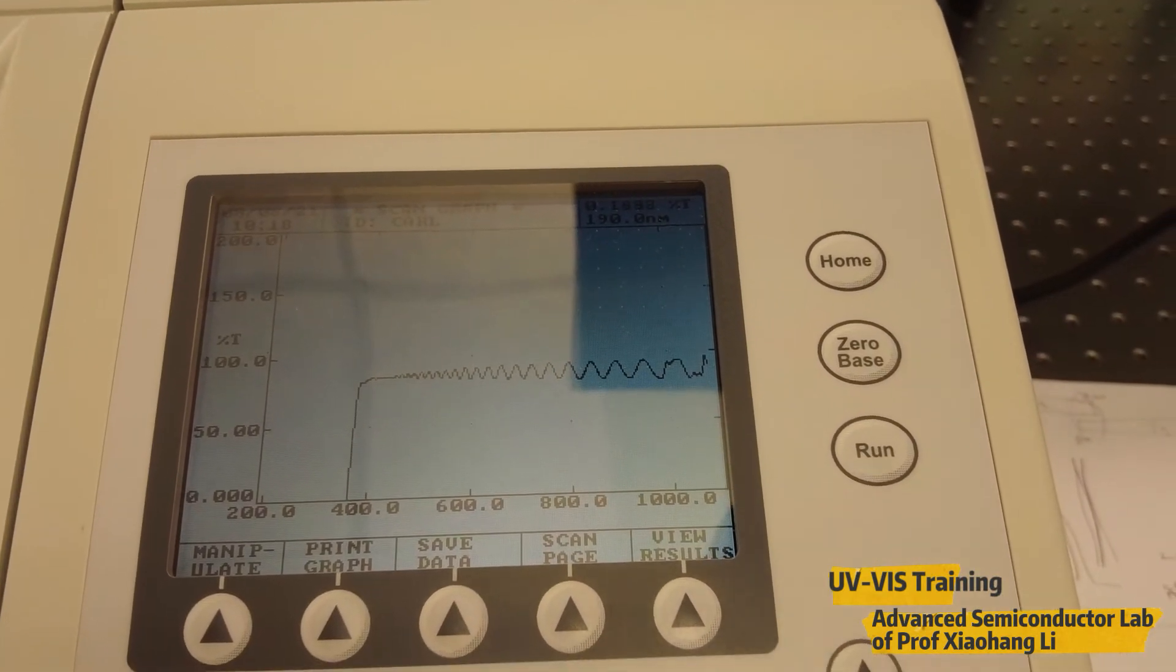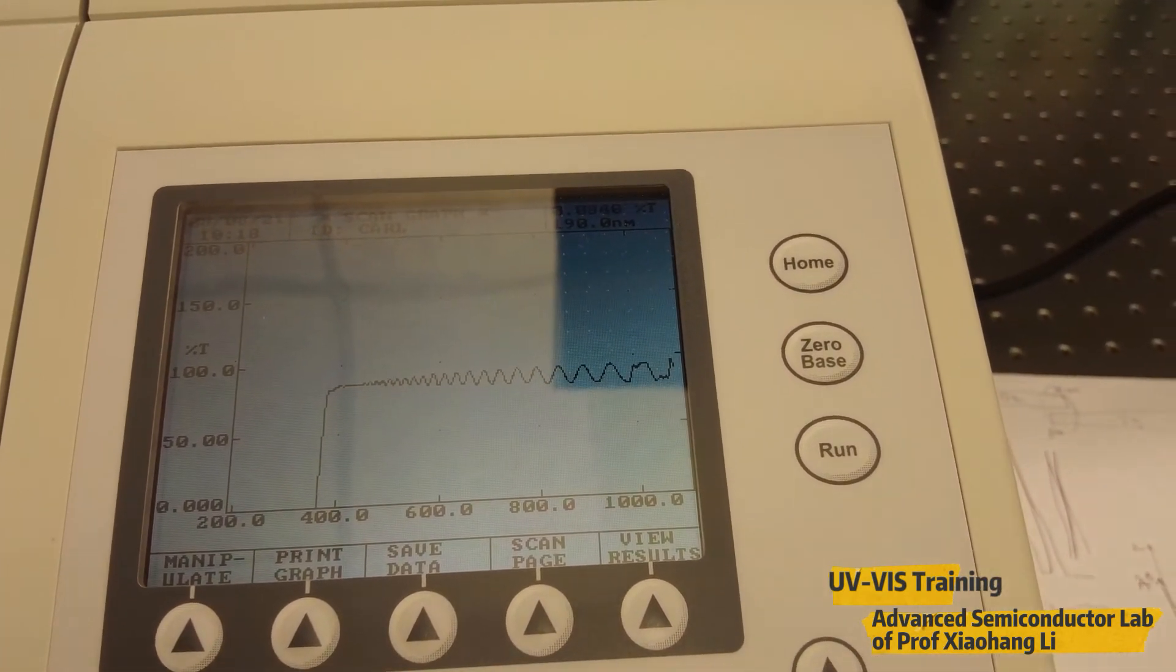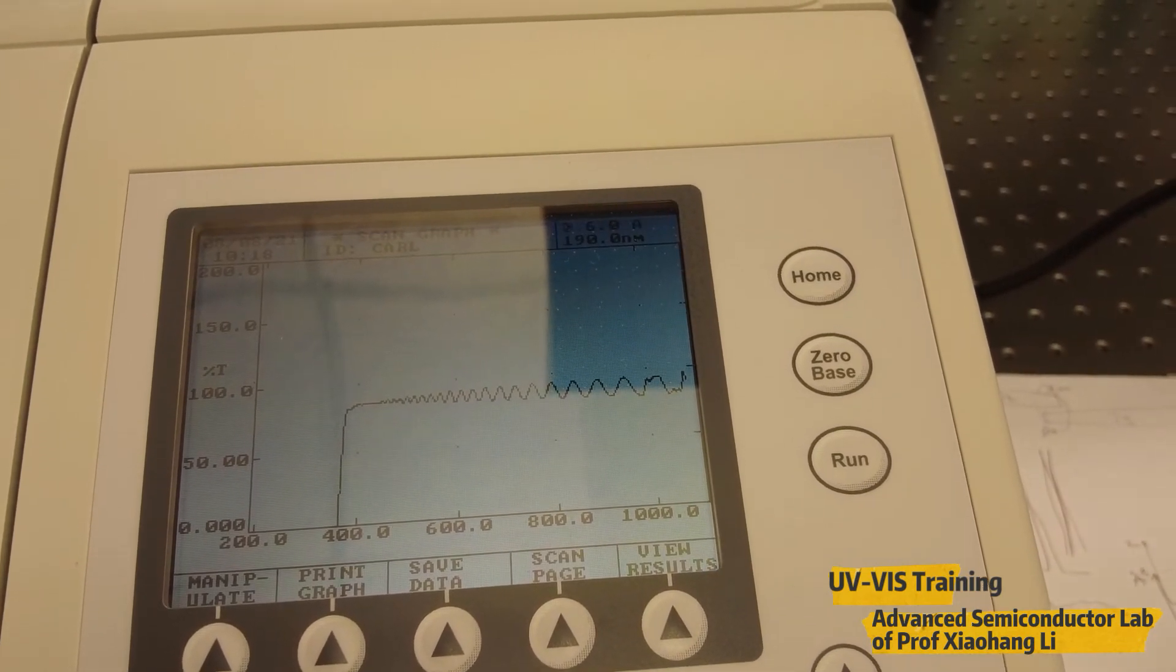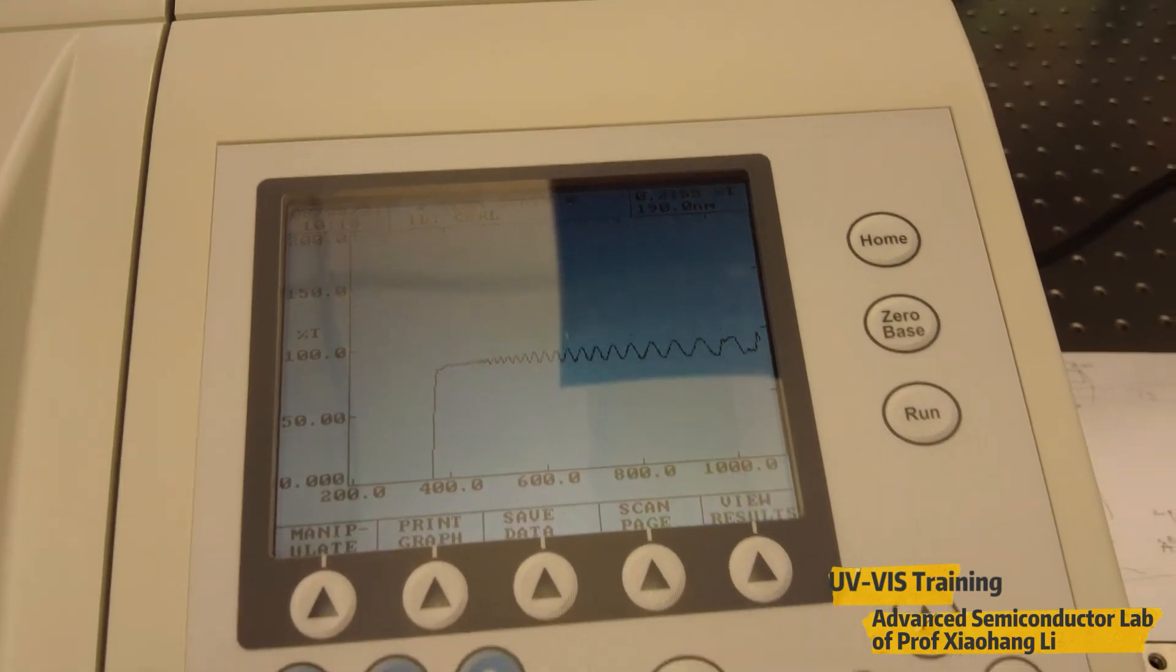Then we can take out our sample and also we can introduce another sample to continue the measurement.